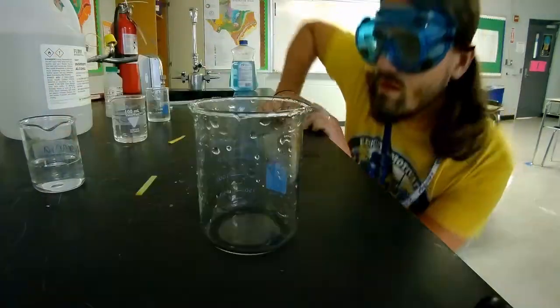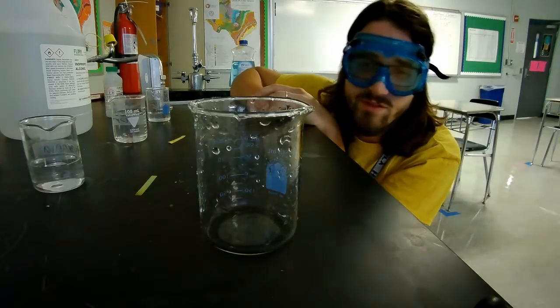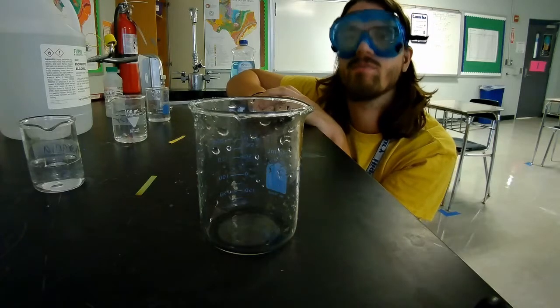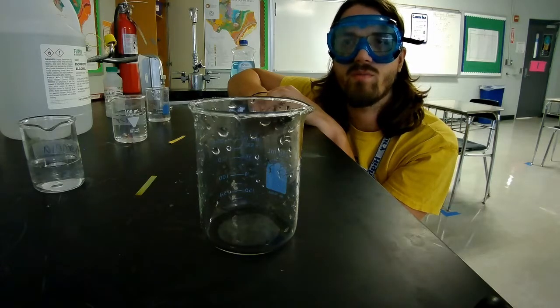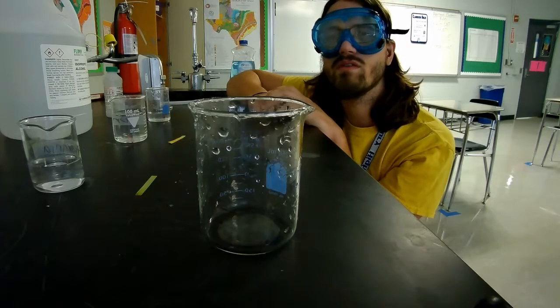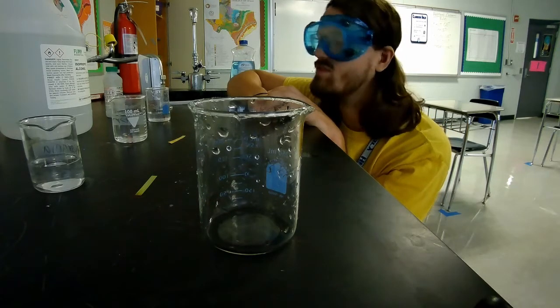Kind of neat. All right, maybe let's try something different. So that first one wasn't too interesting, just a change in smell. Yes, there was a chemical reaction, but not everything always blows up or does something crazy. Let's try some other chemicals. What happens if we do our next strongest base, which was baking soda, and we mix that with hydrochloric acid?